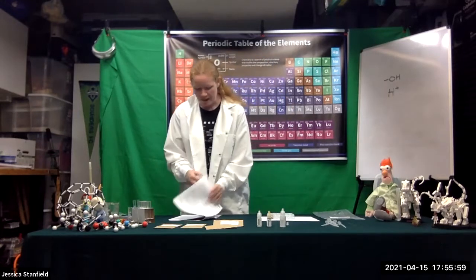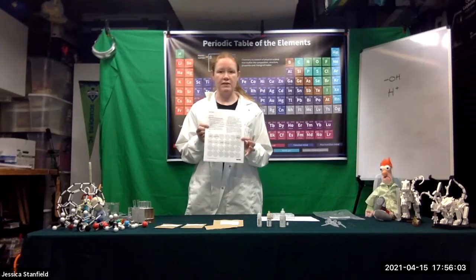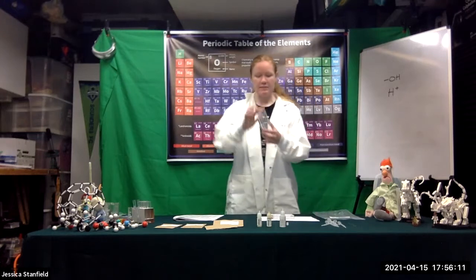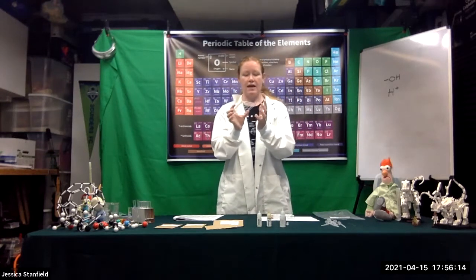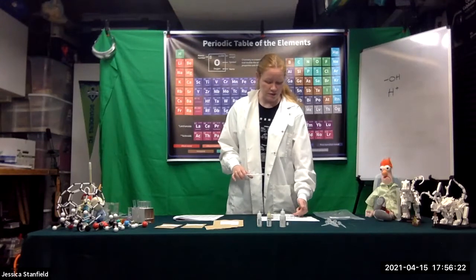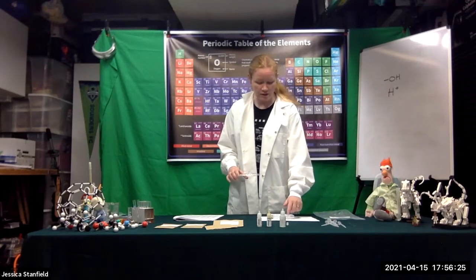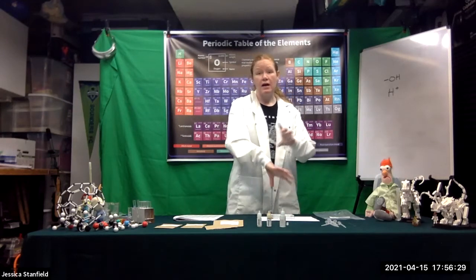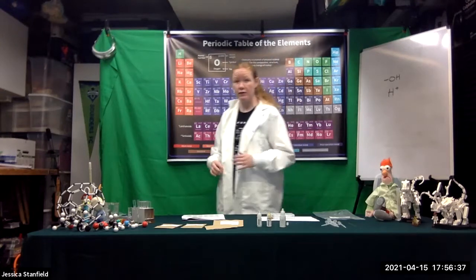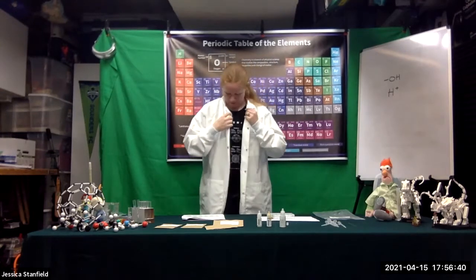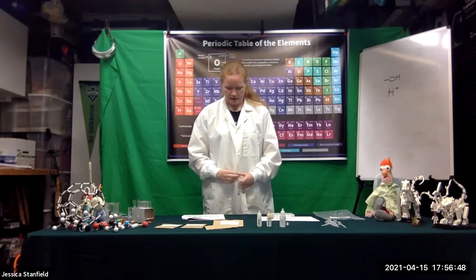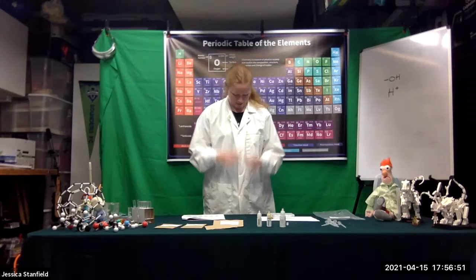Your well plate has a diagram on the first page of your protocol showing wells A1, B1, C1, D1, and so on. When you look at the well plate, it is curved on one end and squared off on the other. The curved end will be the six side, the squared-off end will be the one. Reading down the side gives you A, B, C, D, and across gives you one through six. The wells are already marked so you can easily find your way based on the diagram. Before we go any further, make sure you have your PPE on — lab coat, gloves, and goggles.